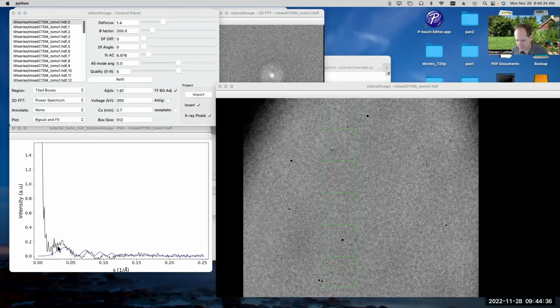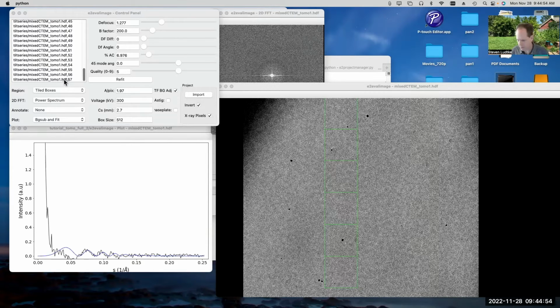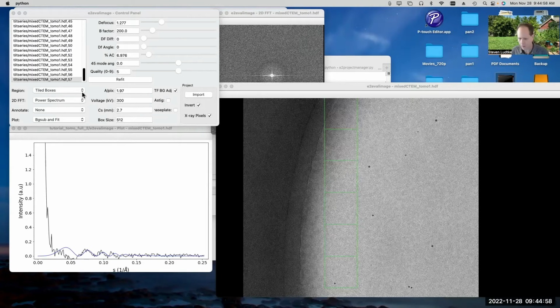We don't necessarily get a terrific quality curve, though, because now we're just looking at this narrow strip, so we don't have as much information, so the curve itself becomes noisier. You'll also note that the defocus there isn't exactly right, so now I need to shift the defocus a little bit. And if I make a curve at a different, let me go to the end instead.